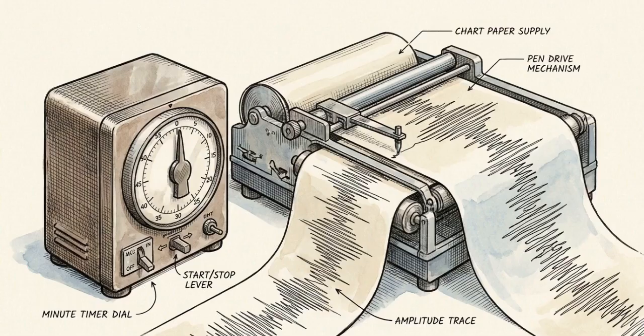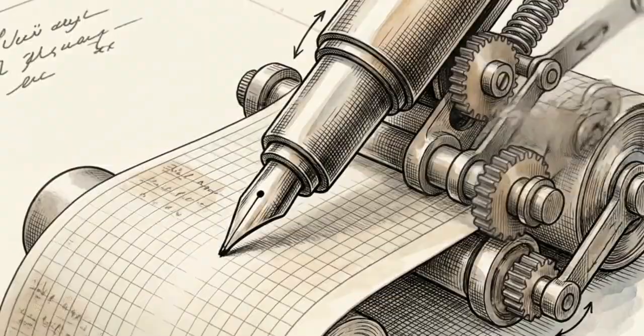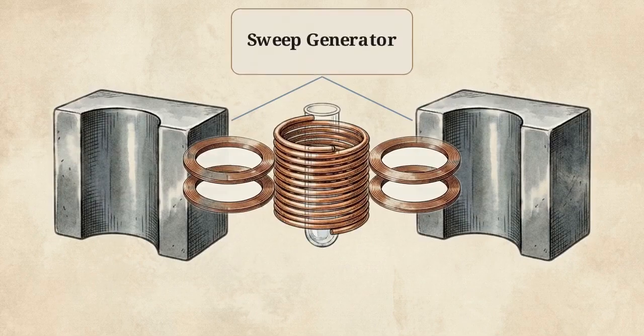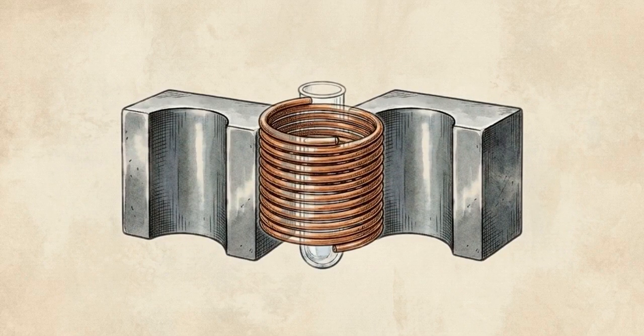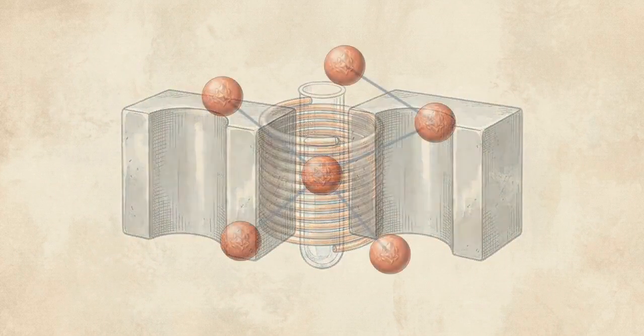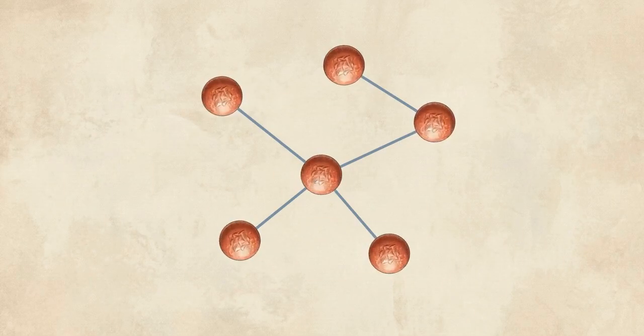The continuous wave method is precise, but scanning frequencies sequentially is incredibly slow. For a weak, rare isotope like carbon-13, a CW scan simply takes far too long to capture a usable signal. To solve this, modern NMR dropped the sweep generator entirely, transitioning to the pulsed Fourier Transform method. Instead of a steady sweep, an FT instrument fires a single, incredibly powerful radiofrequency pulse, covering a wide band of frequencies all at once. Because the pulse spans such a broad frequency range, it satisfies the resonance conditions for every single magnetic nucleus in the entire molecule simultaneously.